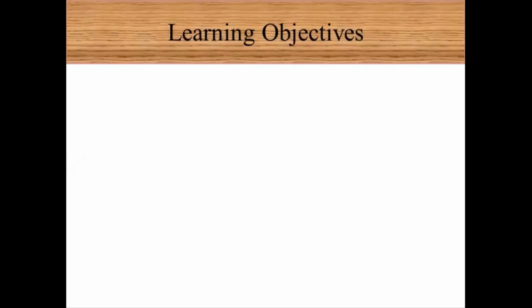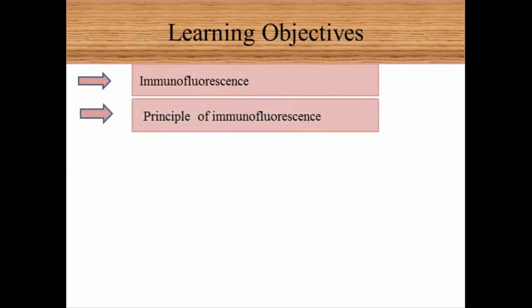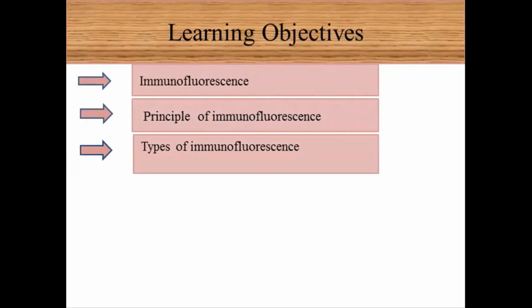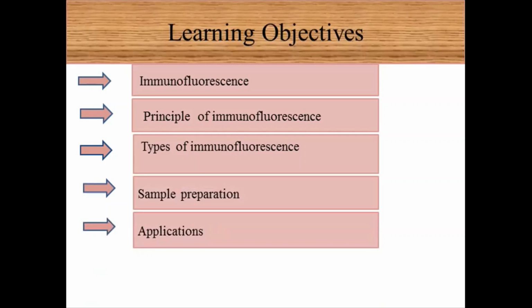Here are the learning objectives of immunofluorescence. What is immunofluorescence? The principle of immunofluorescence, types of immunofluorescence. We will discuss its sample preparation, and at the end we will discuss applications of immunofluorescence.